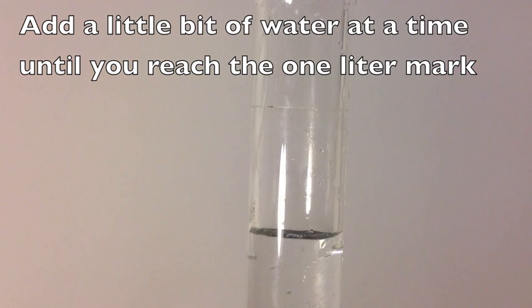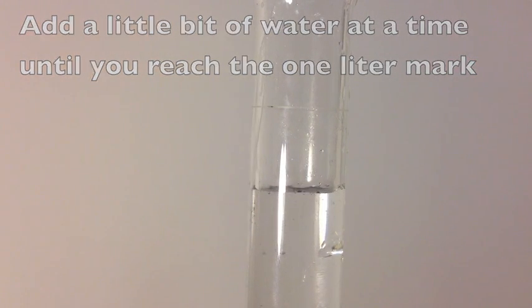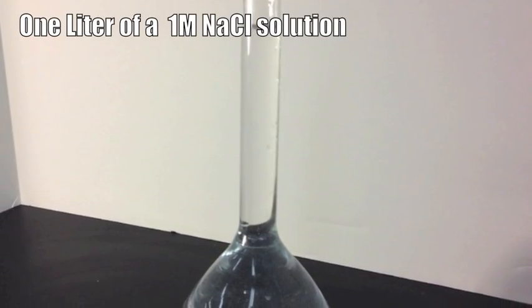And then use a squirt bottle or a pipette or a small graduated cylinder and just add a little bit of water at a time. And then as soon as you hit that line, you're done. You now have one liter of a one molar salt solution.